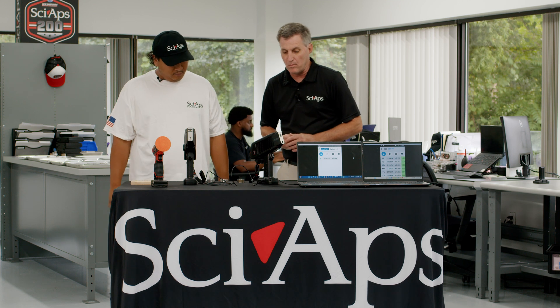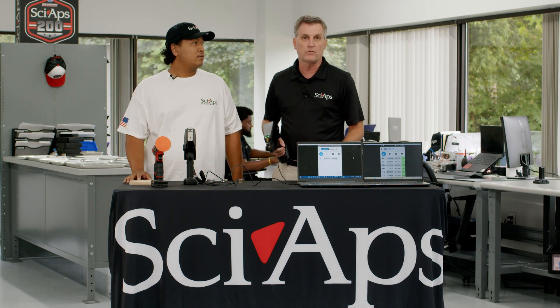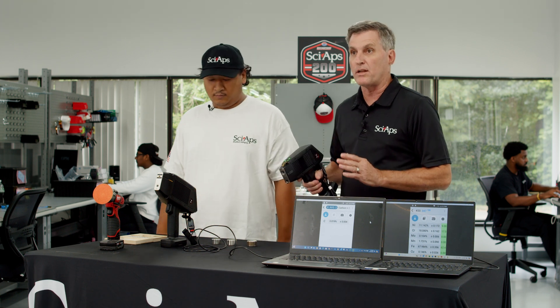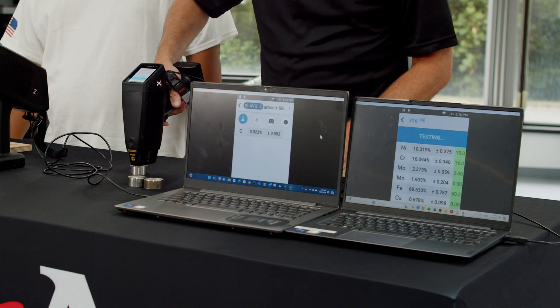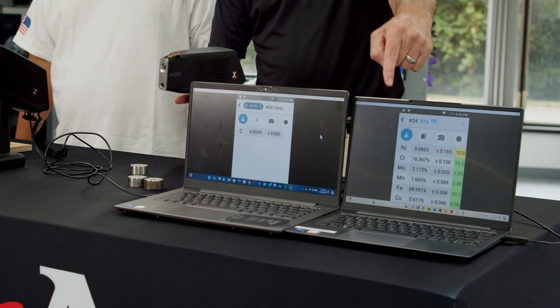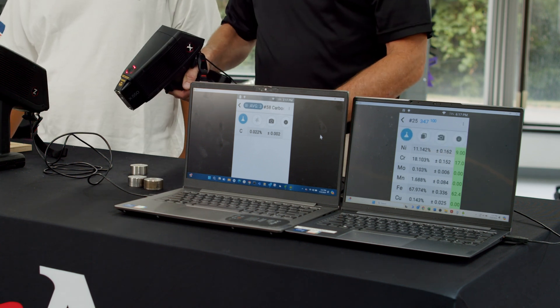Typically in the field you'll be using your instrument to sort material — looking at 304 or 316 or some kind of stainless steel material, or sorting any of your low alloy materials or your high nickel materials. This instrument is capable of doing that and it's basically a point-and-shoot instrument — that's XRF technology. You take the instrument, apply it to the material you want to shoot, pull the trigger for just a few seconds, and then you've got a complete analysis. You're then able to identify that material based on that analysis, and it also gives you the name of that material at the top of the screen.